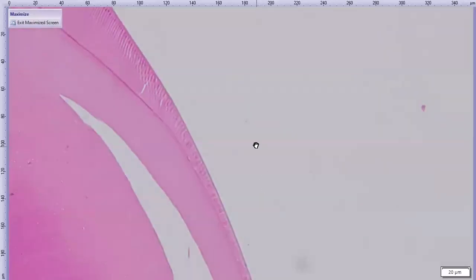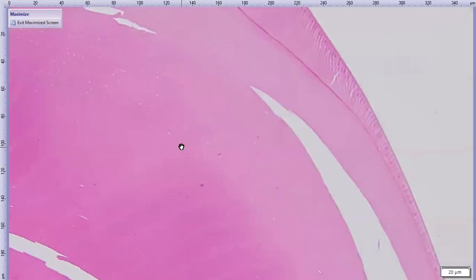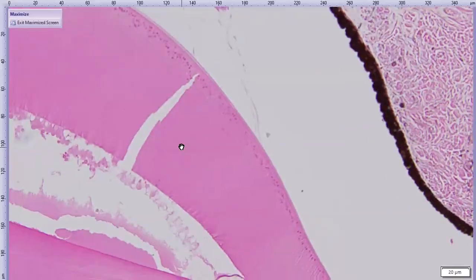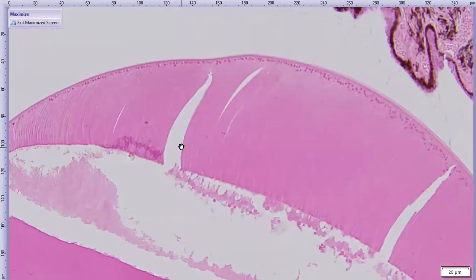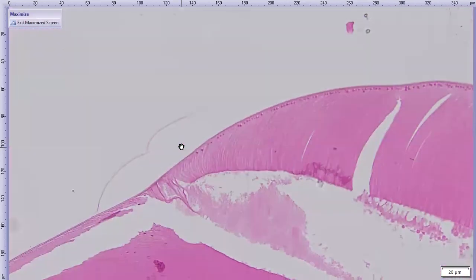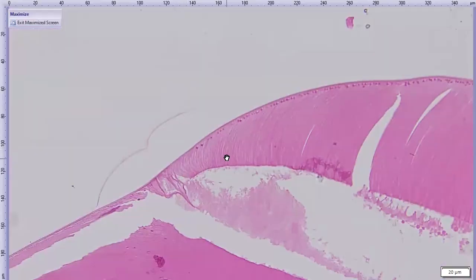So just like in a mammal, the lens epithelial cells are continually evolving, and they undergo mitosis, and they're proliferating. They proliferate at an area more or less like this, and then they march towards the equator of the lens. So in the bird, as they're doing that march, you can see that they get longer and longer until they reach the equator, and then they switch and get shorter and shorter until they reach the back of this portion.